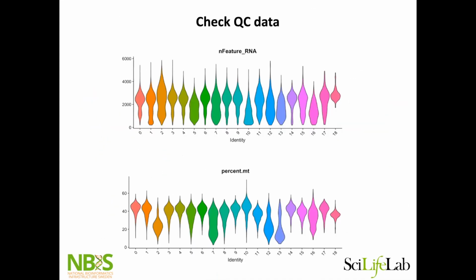Yeah, so always do this. Plot these QC stats per cluster. If they are very different in size, or if some cell type is much more metabolically active and you have higher mitochondria in that one, then it might be fine. So really understand what the clusters are, and understand how these quality control measures relate back to biology, or whether it is a technical artifact.